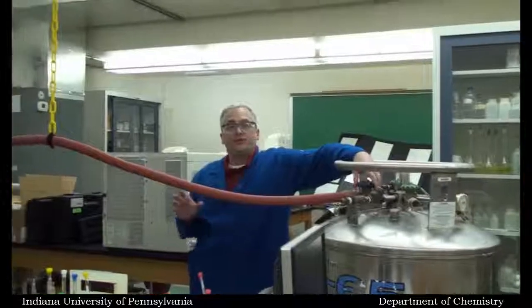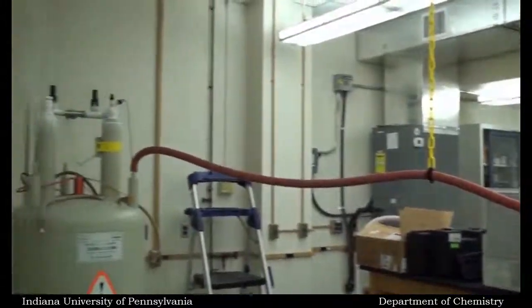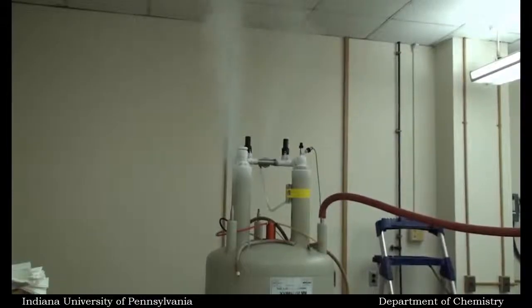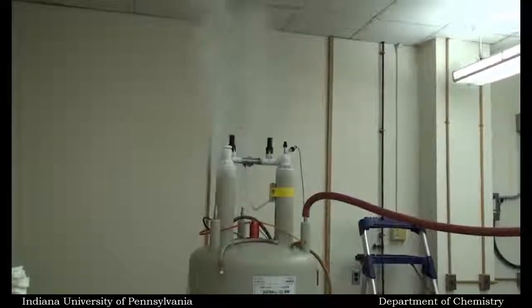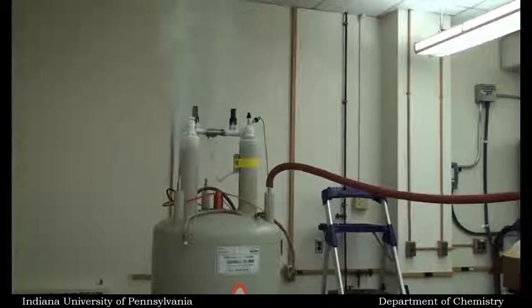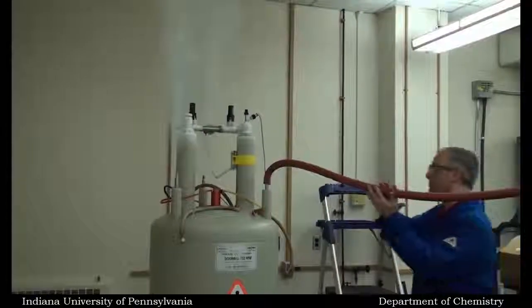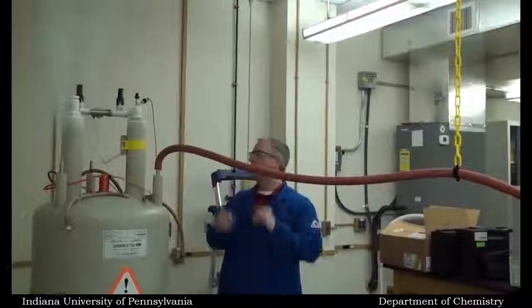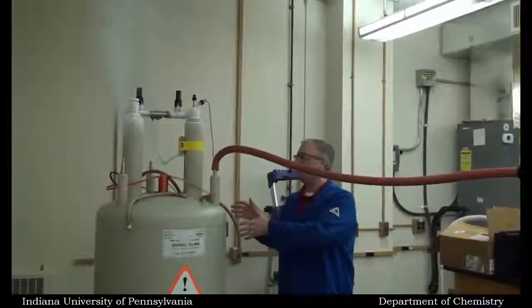Notice at first it's going to sound like a freight train, and it's going to pulse, and you're going to see it act pretty gaseously and pretty violently compared to later. There's a couple reasons. Because you're pushing the liquid, the cold cryogen, across this room temperature tube, and you have to warm up this warm tube in order to get liquid into the NMR Dewar.